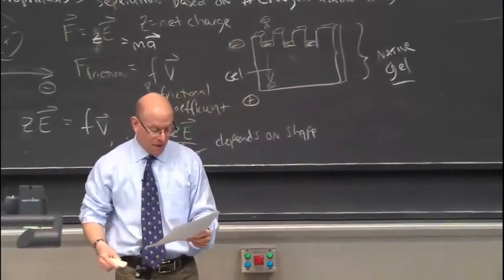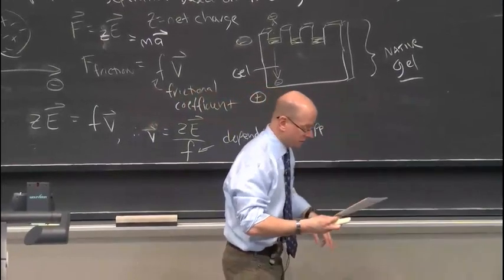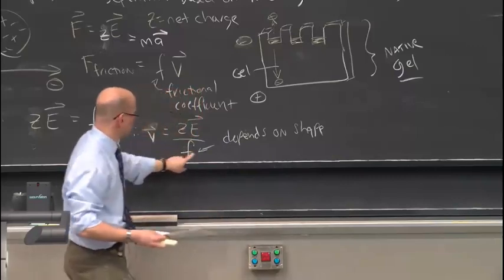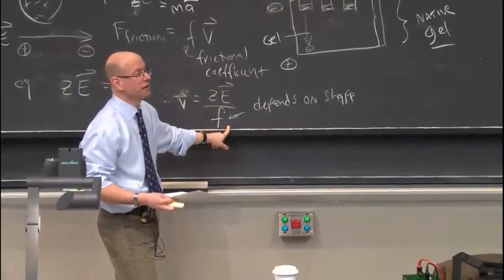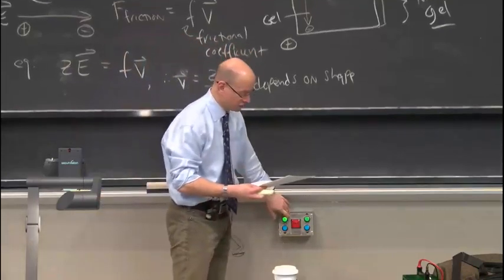And clearly, if I do a native gel, I'm going to end up with two problems, right? Proteins moving in opposite directions, and proteins whose movement depends on the shape of the protein. Doesn't mean it's a bad technique. People do this technique. It's sometimes useful. But it's not going to be helpful for what we want to talk about, which is purifying proteins from scratch.